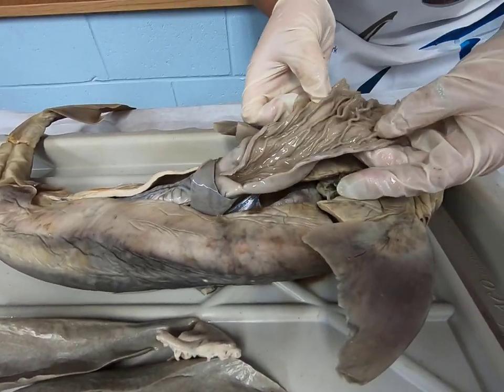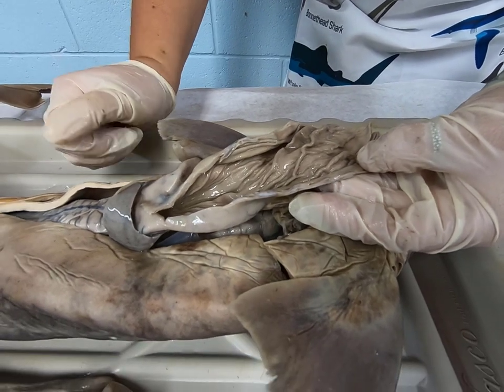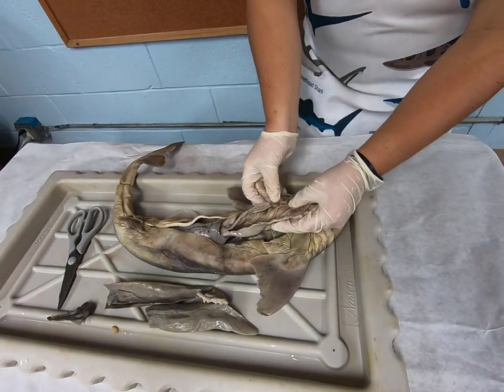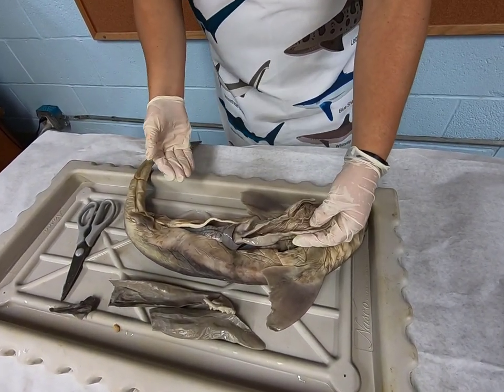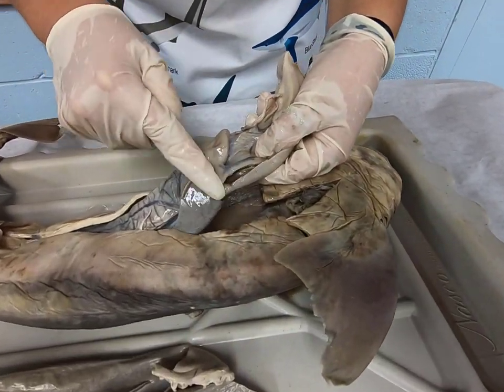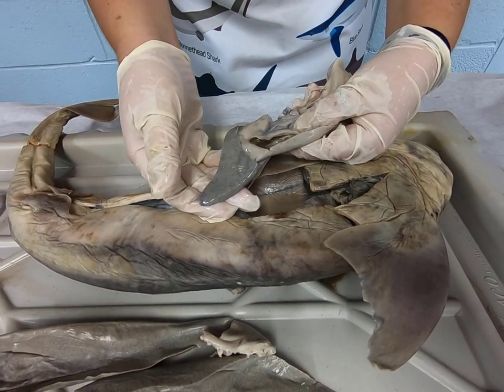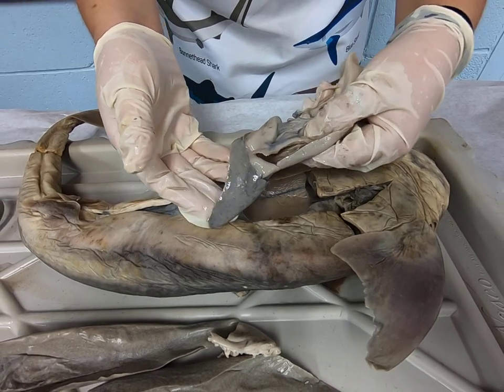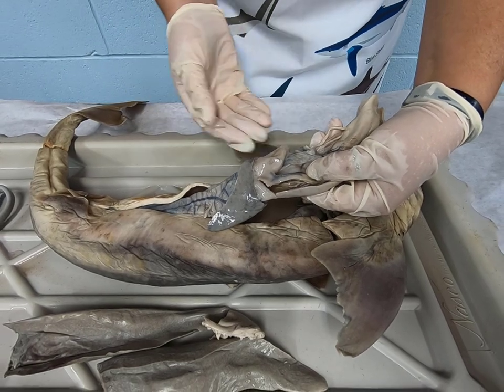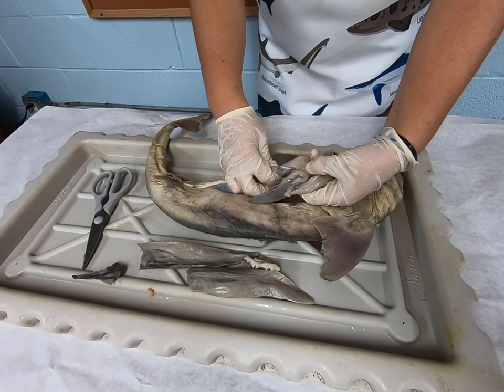And the shark's stomach can expand 3 times its size. So whenever it's eating, it can actually bulk eat. They can eat a whole bunch and it can expand their stomach. And this allows them to not have to eat for months. We have this J-shaped curve right here. And on top of it, we have our spleen, which helps with our immune system and filters the blood. Sharks also are susceptible to viruses and diseases in the ocean. We can't all catch those, but they do have to keep their blood clean.